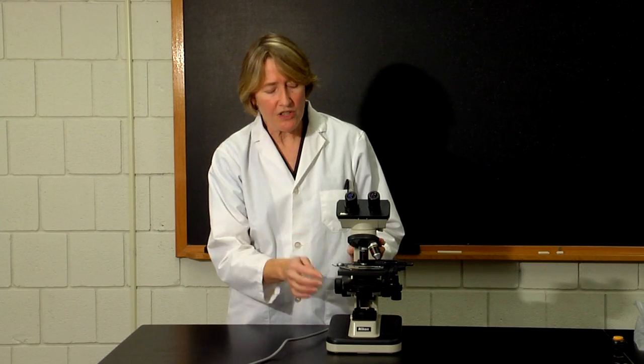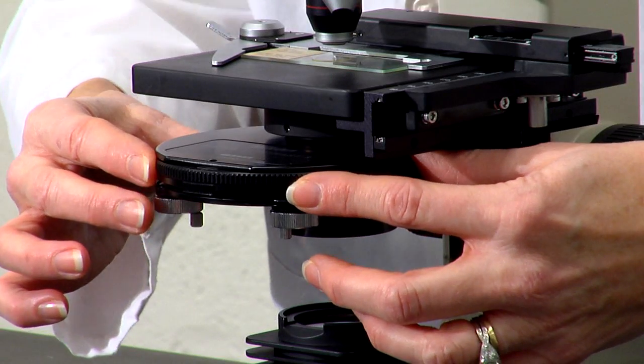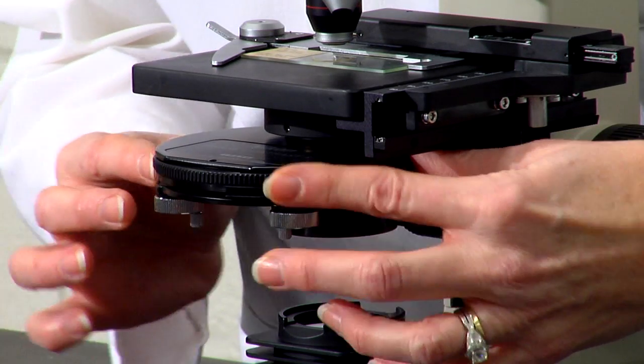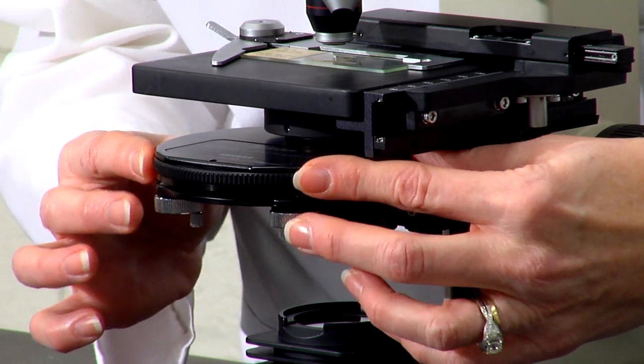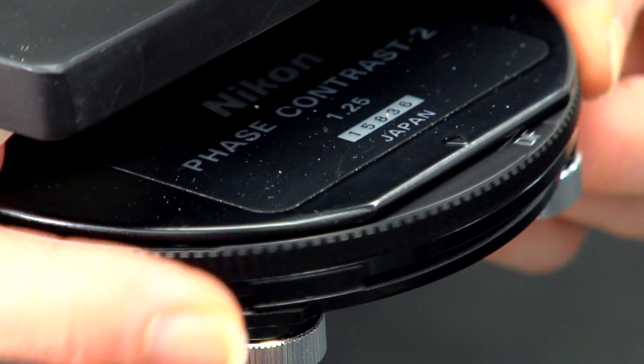To use either of these types of microscopy, you need to adjust the rotating disk in the condenser lens system. For dark field, you need to adjust the condenser lens system to DF.